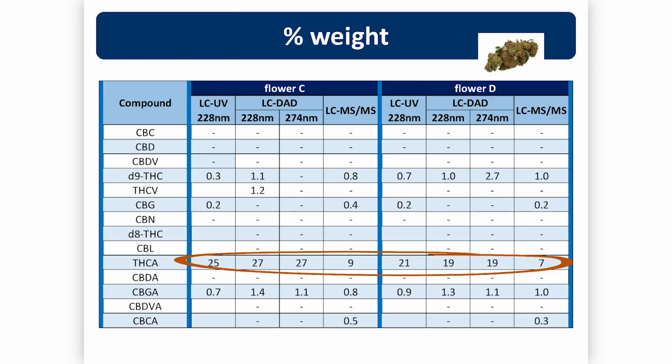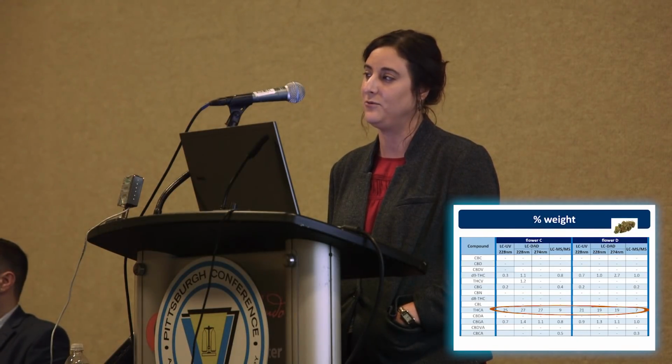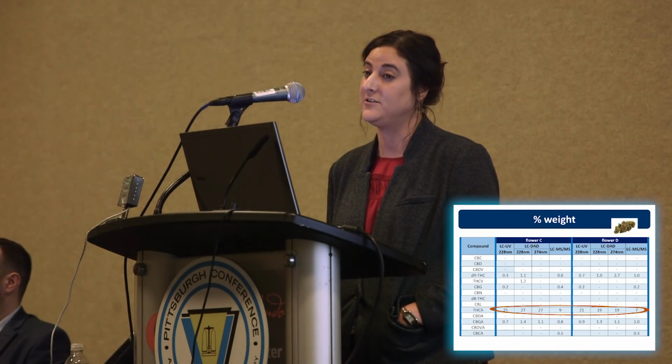I don't want to say either way at this point because I've not been able to back it out. I've tried a few things to determine if there's an issue. And again, this isn't necessarily a high level, and so there's lots of things that this could be. Is there a matrix issue with the LC-MS? Is there an issue with the ionization source being heated that's causing an issue? So there's lots of heads shaking now. So I'm going to get some good information after this, I think.